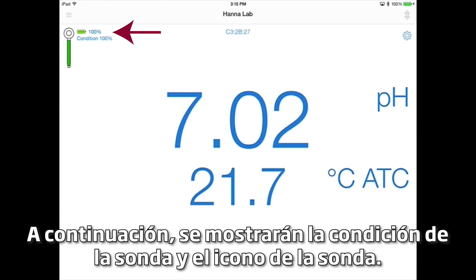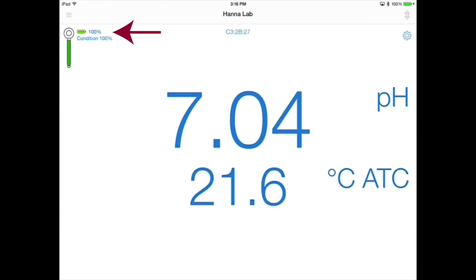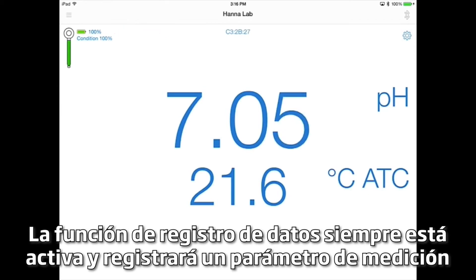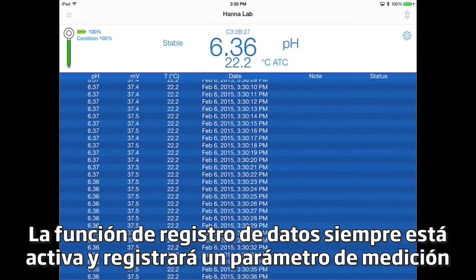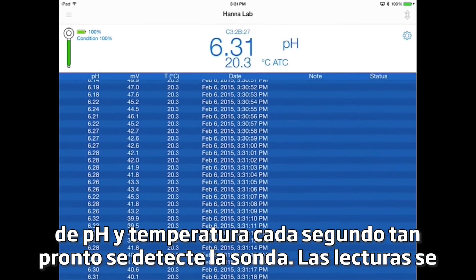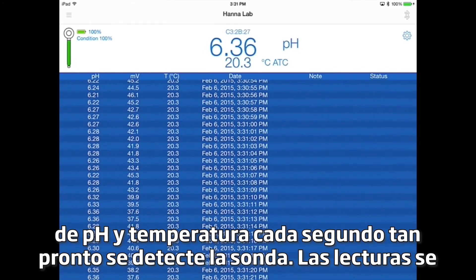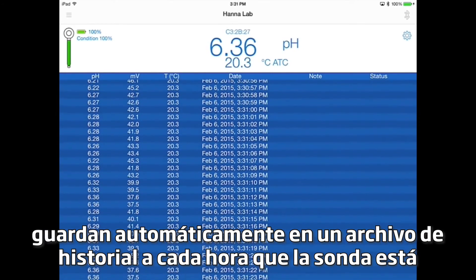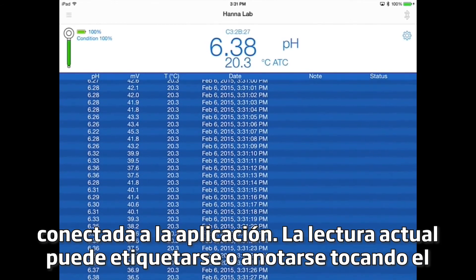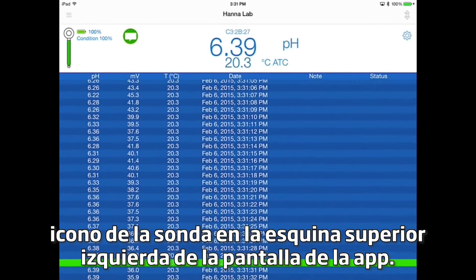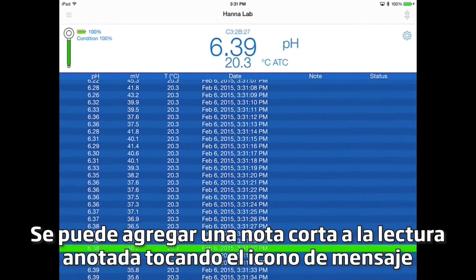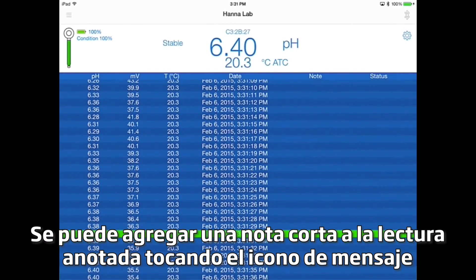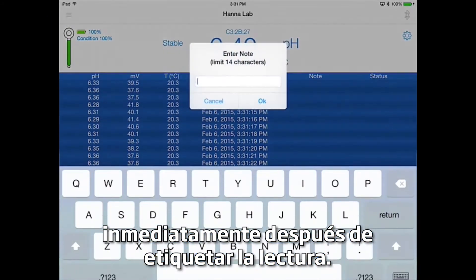Your probe condition and probe icon will then be displayed. The data logging feature is always active and will log a parameter — pH and temperature — every second as soon as the probe is detected. Readings are automatically saved to a history file every hour the probe is connected to the app. The current reading may be tagged or annotated by tapping the probe icon in the top left corner of the iPad display. A short note can be added to the annotated reading by tapping the message icon immediately after tagging the reading.